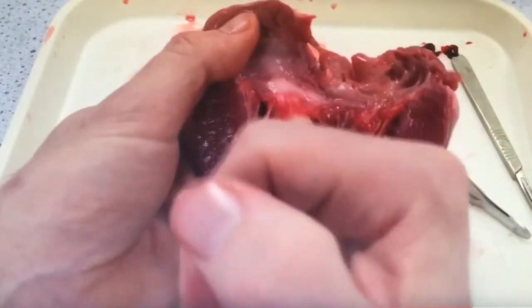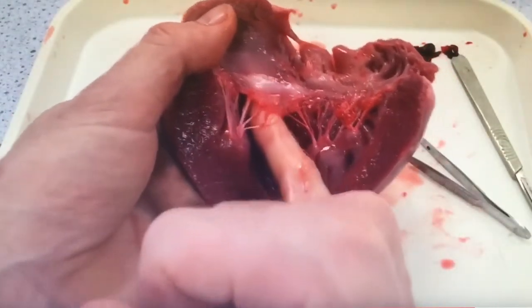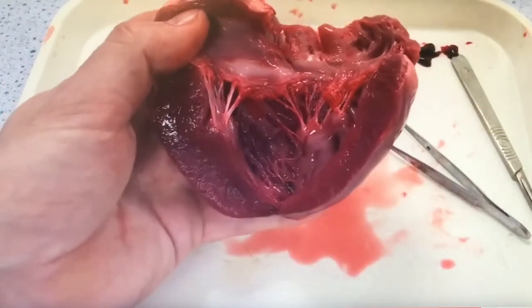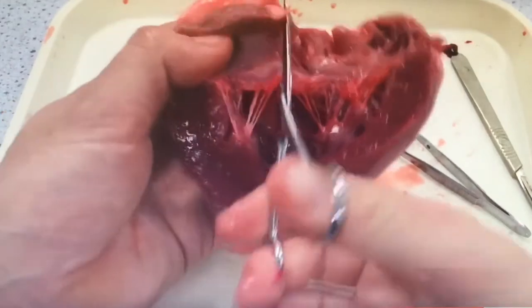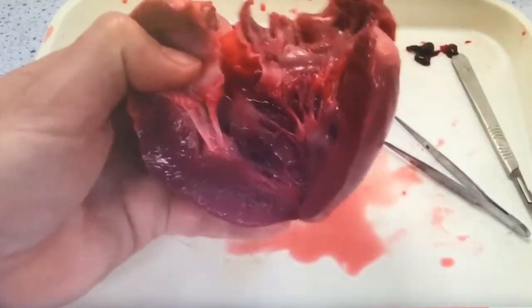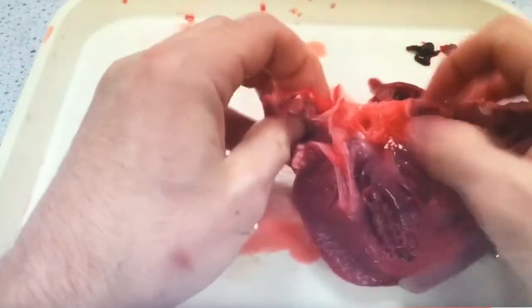Sven follows the ventricle up with his little finger into the atria, and then follows that up with a pair of scissors. What that opens up is the semilunar valve of the aorta. The semilunar valve has three cusps, which you can see here.